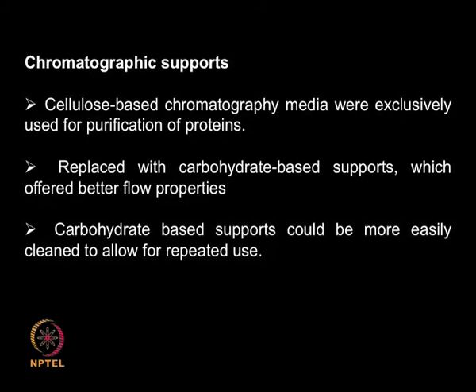Originally, they used to have cellulose based media for purification of proteins. Later on, they moved into carbohydrate based supports because it offered better flow properties, because it can be cleaned properly after repeated use, because you want to reuse many thousands of hours.